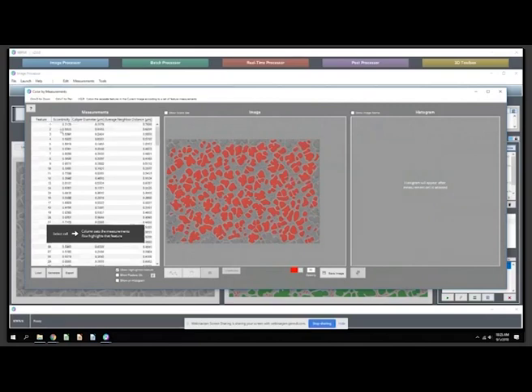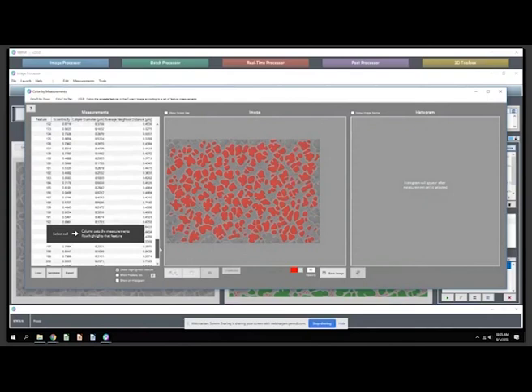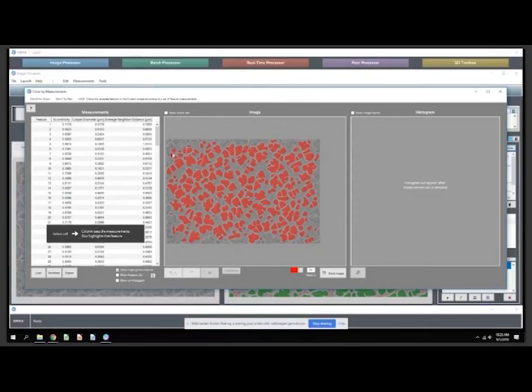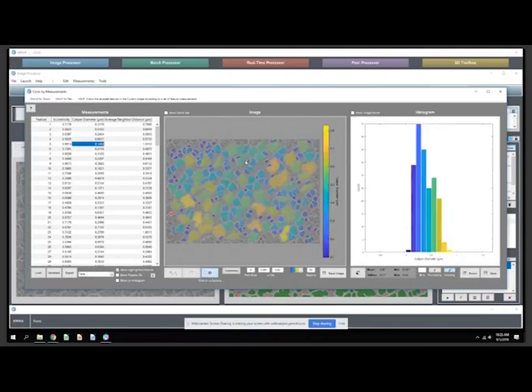And yeah, you could label everything with a 1 through however many features are in here, 205, but it's not very much fun to give someone an image with things labeled with a box in their center, 1 to 205, and a corresponding spreadsheet. What you'd rather see is something like this, where you now have every feature immediately colored by its size. There's linkages between the data and the image.